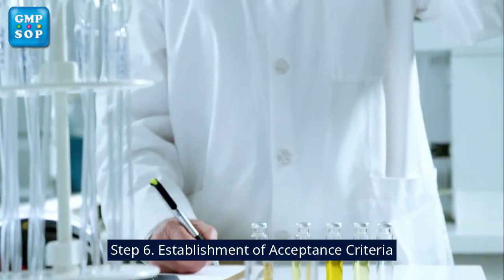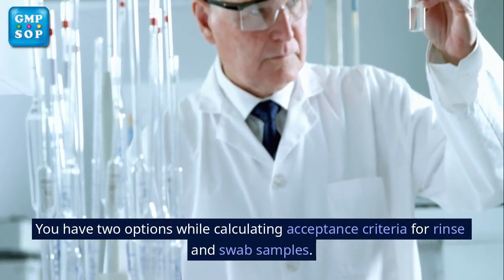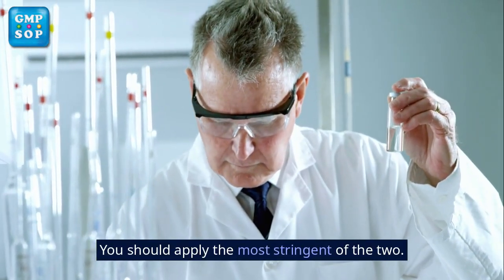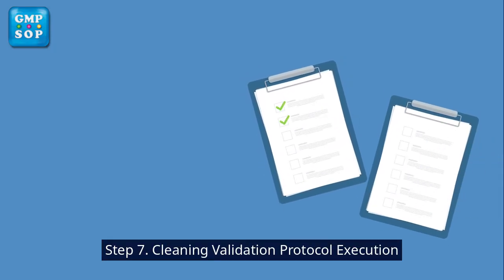Step 6. Establishment of acceptance criteria. You have two options while calculating acceptance criteria for rinse and swab samples. You should apply the most stringent of the two. Step 7. Cleaning validation protocol execution.